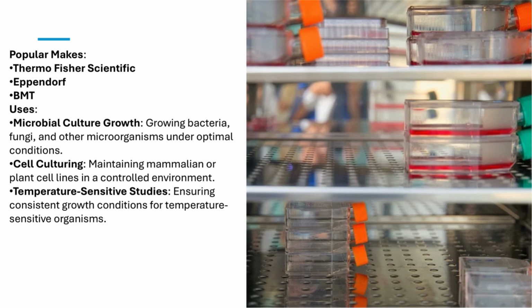Temperature-sensitive studies. Many organisms have strict temperature requirements for growth. Incubators ensure that temperature-sensitive organisms can grow under consistent conditions, giving researchers the best chance for accurate results. Whether you're growing bacteria, culturing mammalian cells, or studying anaerobic organisms, the incubator is indispensable in any microbiology lab. It helps create the perfect conditions for microbial growth and ensures that experiments are consistent and reliable.